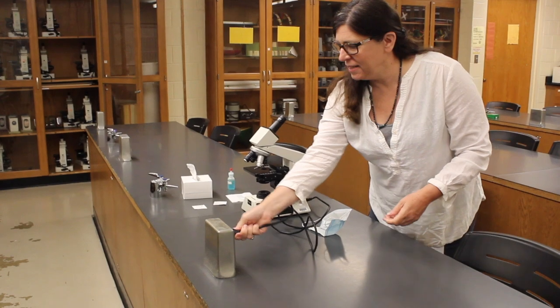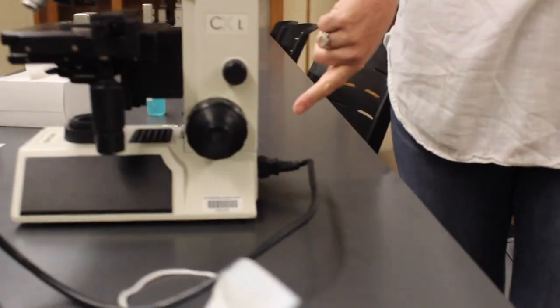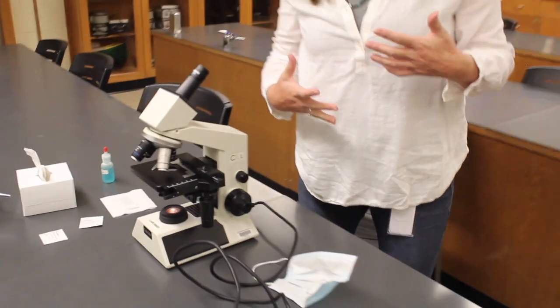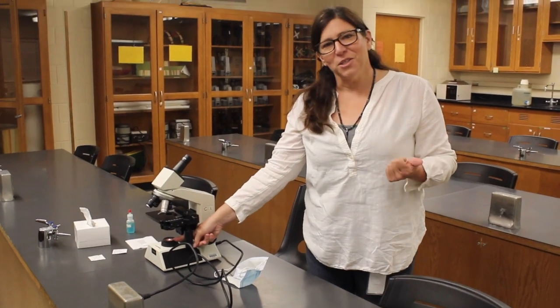All right, it's plugged in now. And then we have to turn it on. There's a little switch on the back of the microscope right here. When you turn that on, that does turn on the power. Sometimes you might see the light coming on, and the light is on right now, and that's fine. That tells you your microscope's on.